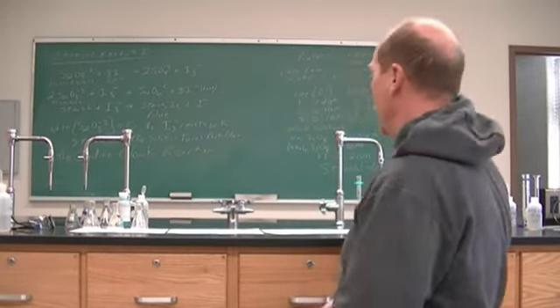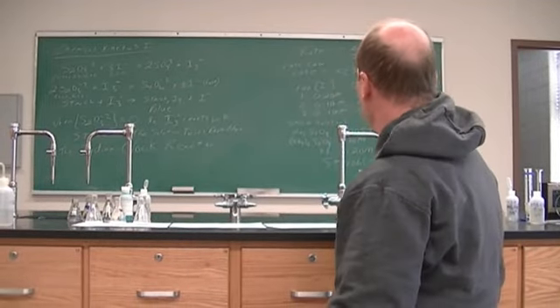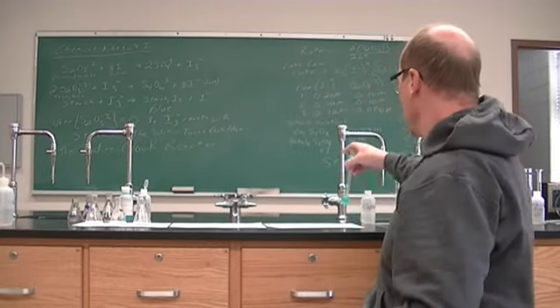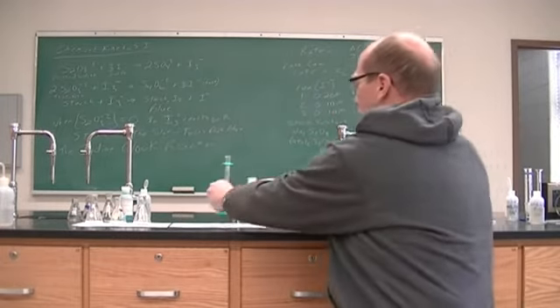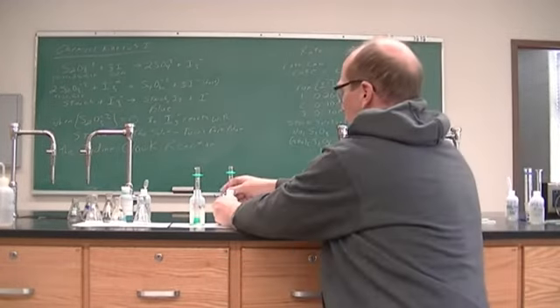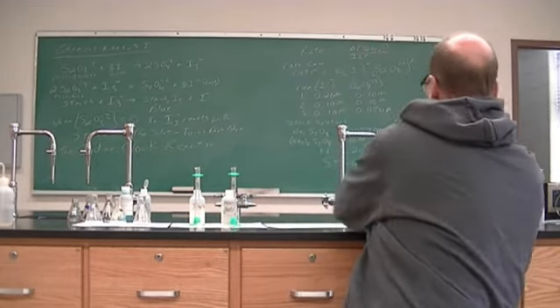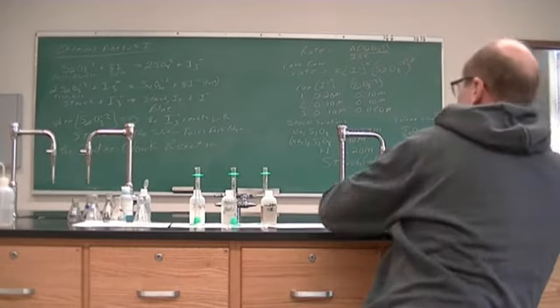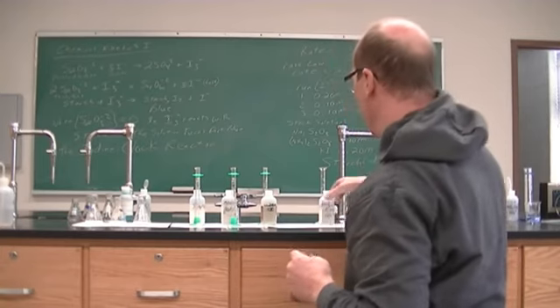All right. So we are going to start doing the reaction. We will start with run 1, which is using our stock solutions. We cannot mix our solutions until they are in our reaction flask. So we're going to have our starch, then our S2O3 2-, then our KI, and then we're going to start the reaction by adding our S2O8 2-. And that's when we will start our timer.